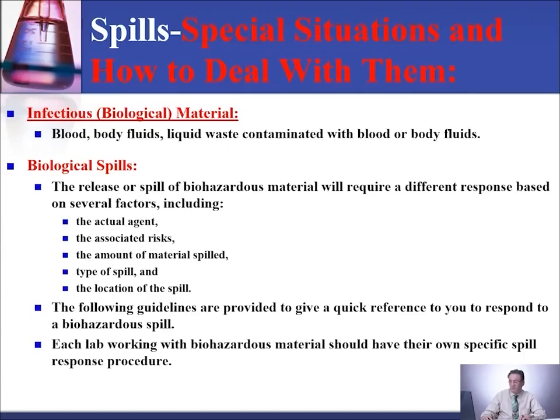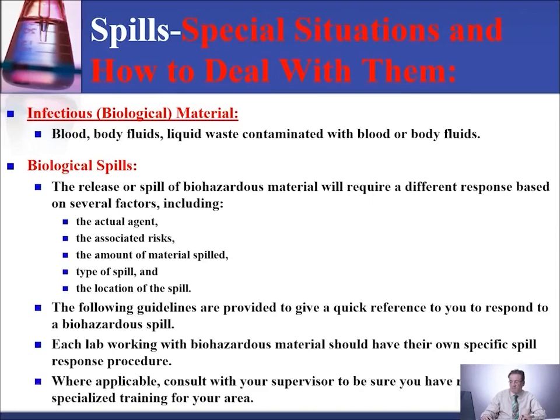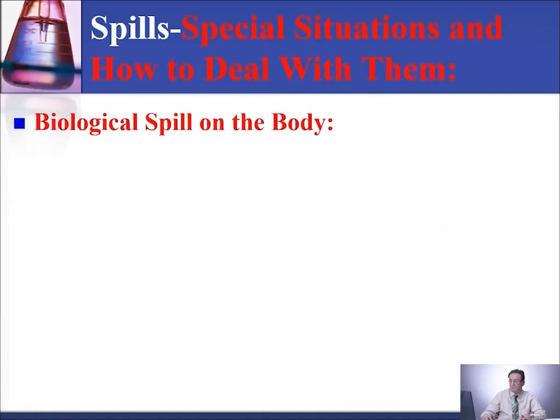Each lab working with biohazard material should have its own specific spill response procedure. Where applicable and appropriate, consult with your supervisor to be sure you have received the specialized training for your area.